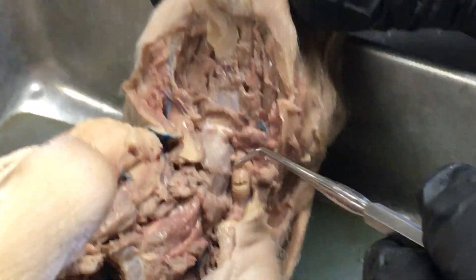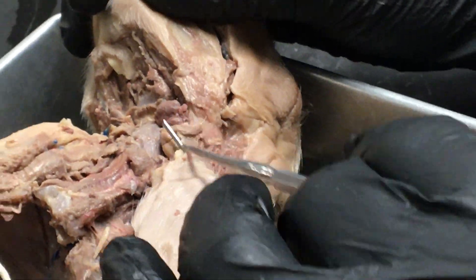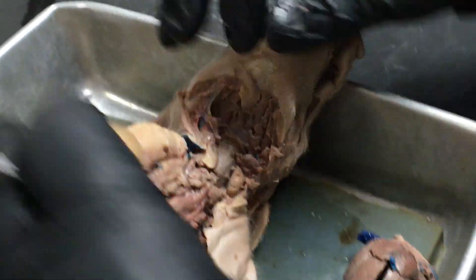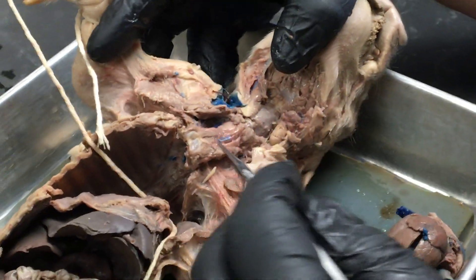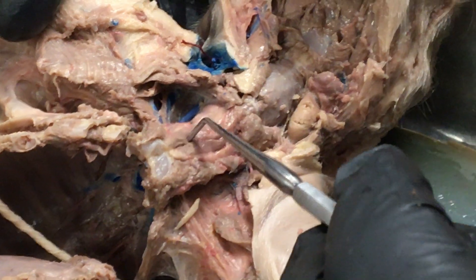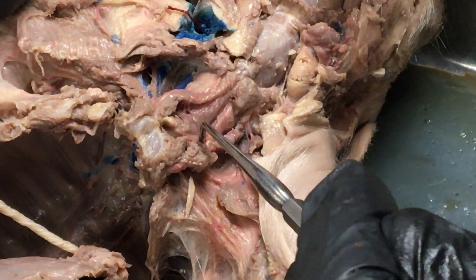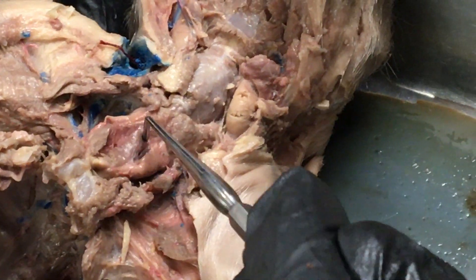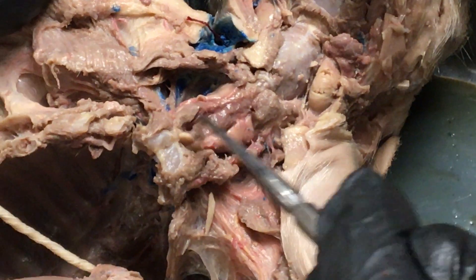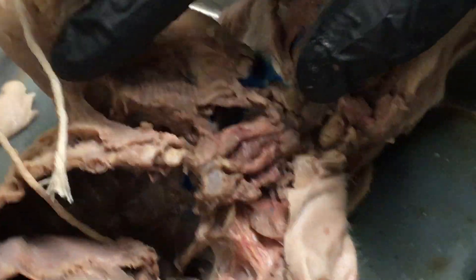We can see the pharynx is the back area of the mouth. If we close the mouth and look at a lateral view, we can see the submaxillary gland right here. Looking at the neck, we find the thymus gland right here. And there's the thyroid gland — it's not quite the shape it's supposed to be; it's supposed to be round. So there's our thyroid gland — again it's supposed to be a circular kind of shape.